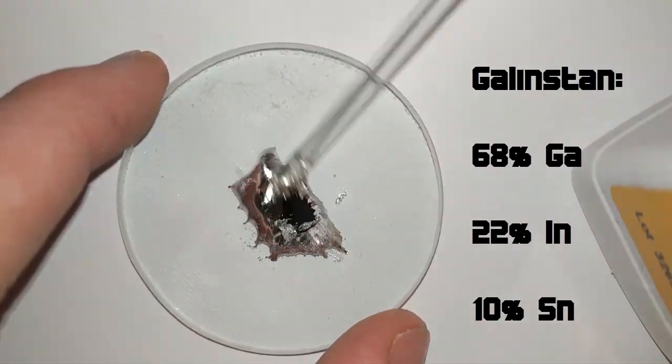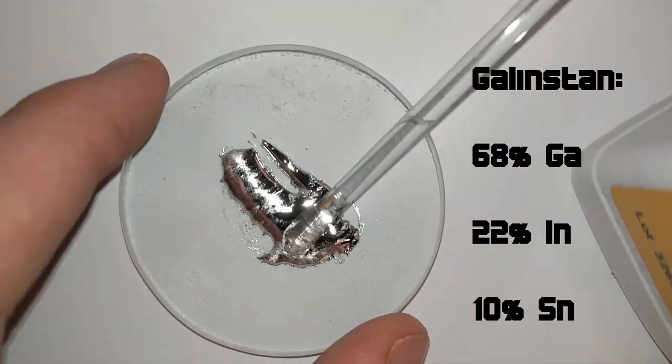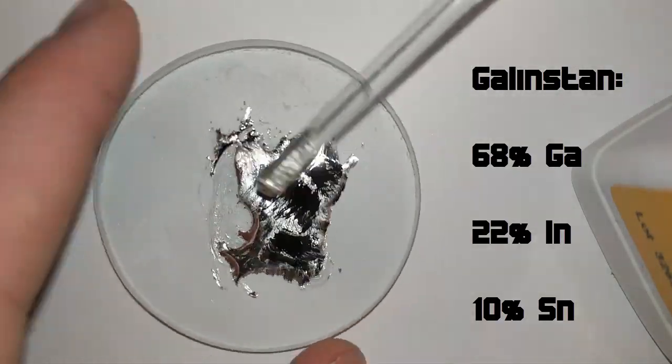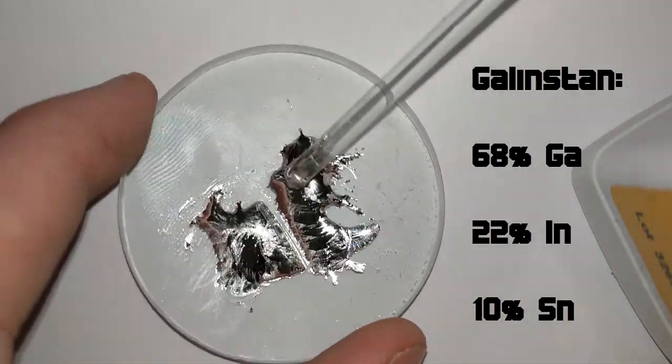Interestingly enough, this alloy stays liquid at room temperature and was therefore used in mercury-free thermometers. A major downside though is that it's kind of sticking to smooth surfaces like glass.